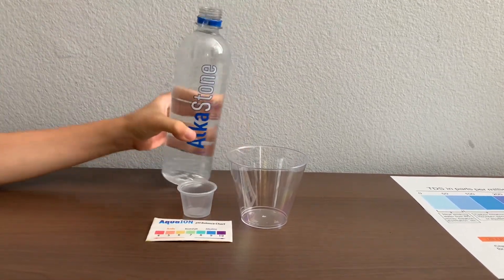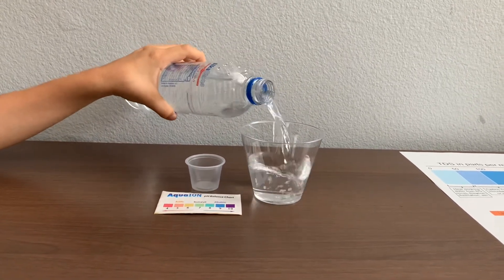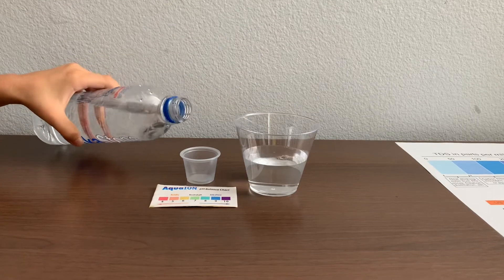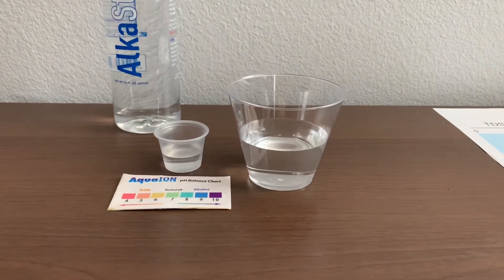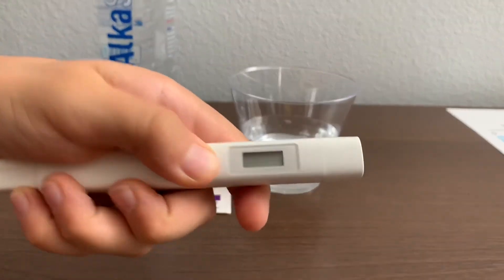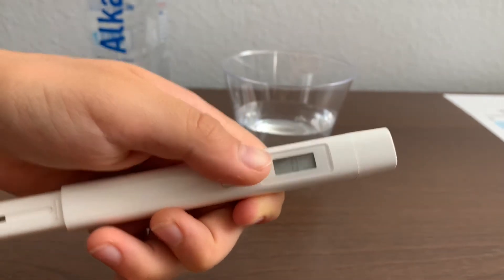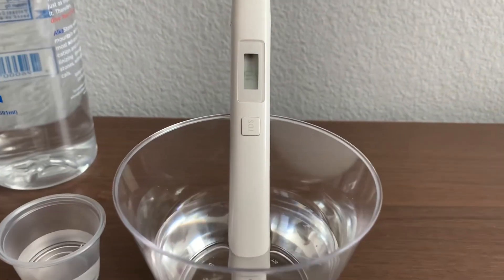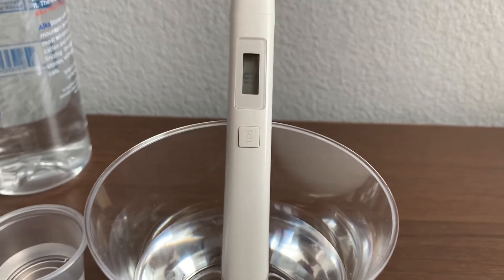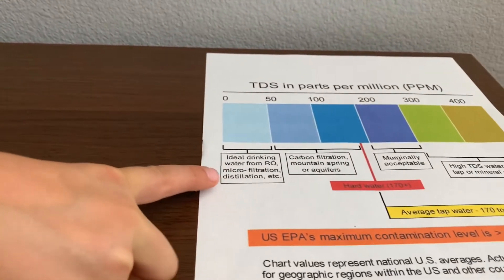Let's pour some water in. First, let's test the TDS level. Turn on the TDS tester, make sure it says zero, and put it in. Ten — that is microfilter distilled water.